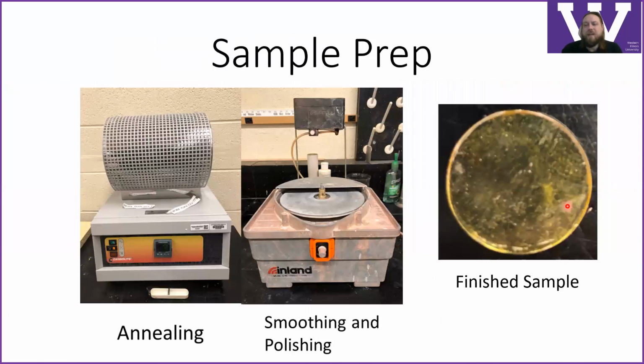Afterwards, after the quench, we have these samples that are fairly fragile, and they break really easily, and we put them in an annealer right after that. So the annealer is going to raise the temperature to about 325 degrees Celsius. This is close enough to the melting point so that the molecules inside the glass can move a little bit, and they can release the thermal stress that's within the glass, making it so fragile.